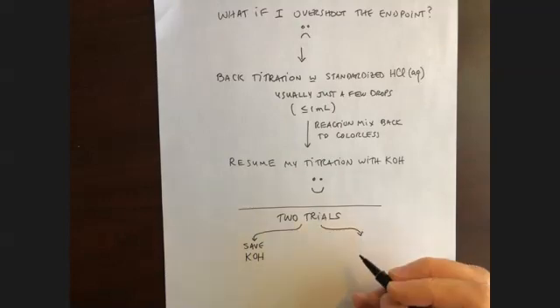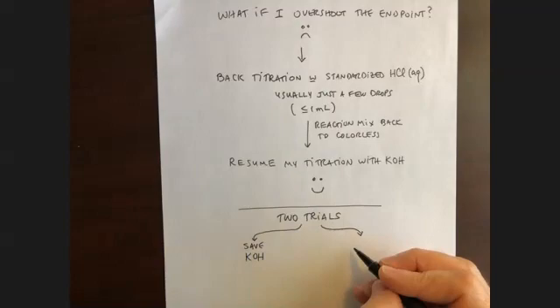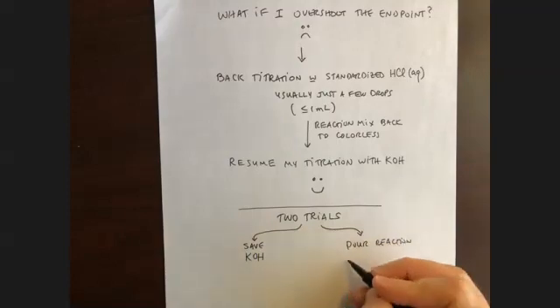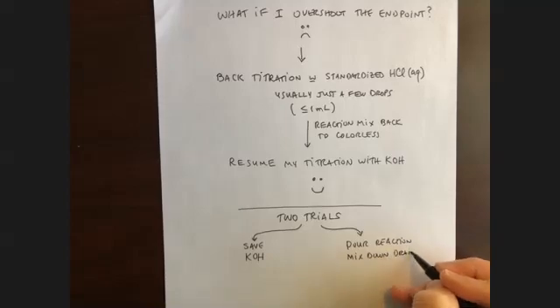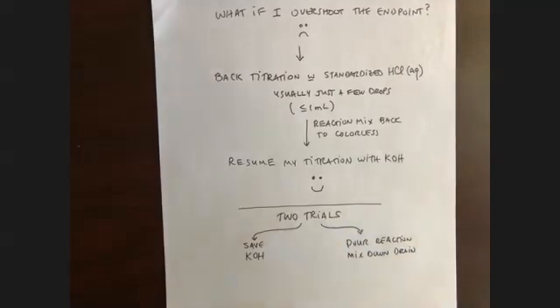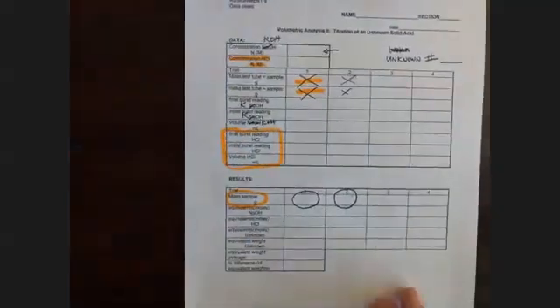And also, you would have to discard your waste. You're going to basically pour your reaction mix down the drain because everything that we're using in this lab is non-toxic, safe. Now, remember, when I say pour something down the drain, it doesn't mean just pour it. It means you have to flush it with some running water. All right. Now, a couple of things about the lab in its dry lab mode that we're doing.